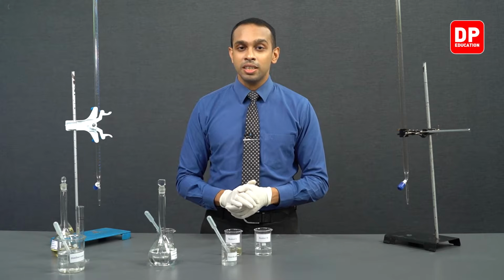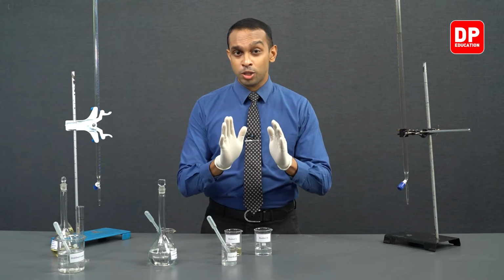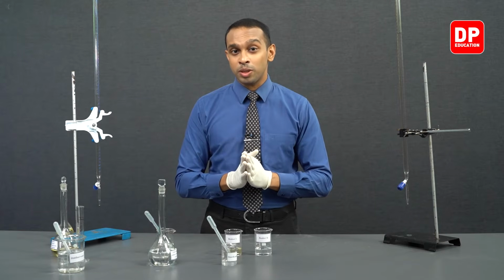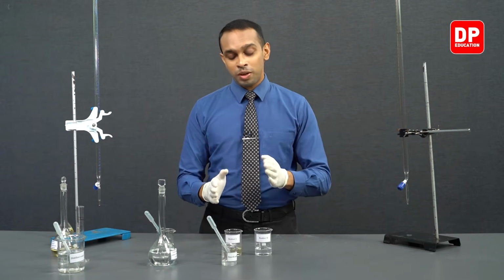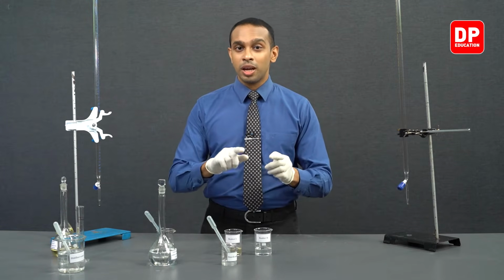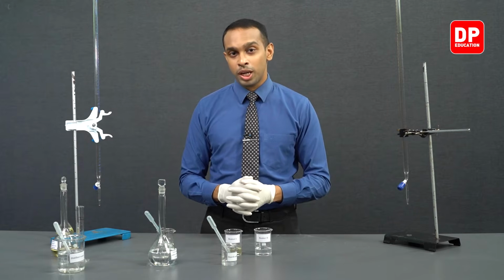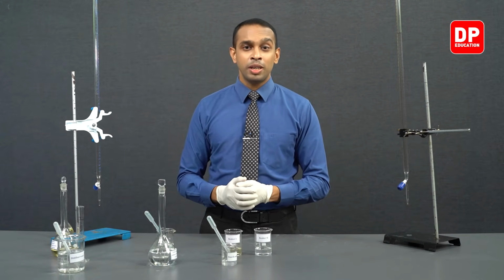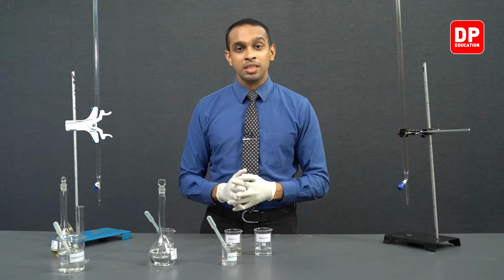It is time for us to mix it, and then as soon as we mix it, we are going to use a stopwatch and we are going to measure the time taken for the color change to happen. Now students, when you are doing this, it is better if you can stir the solution. So to stir the solution, you can use a glass rod or you can use a magnetic stirrer. So it is optional.